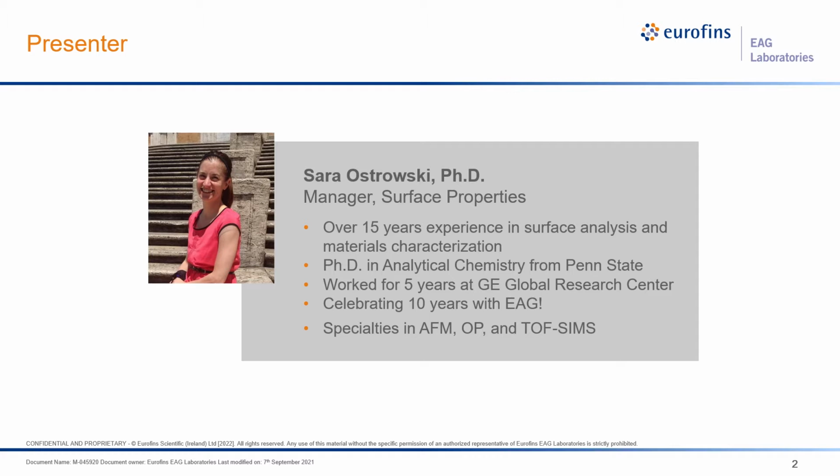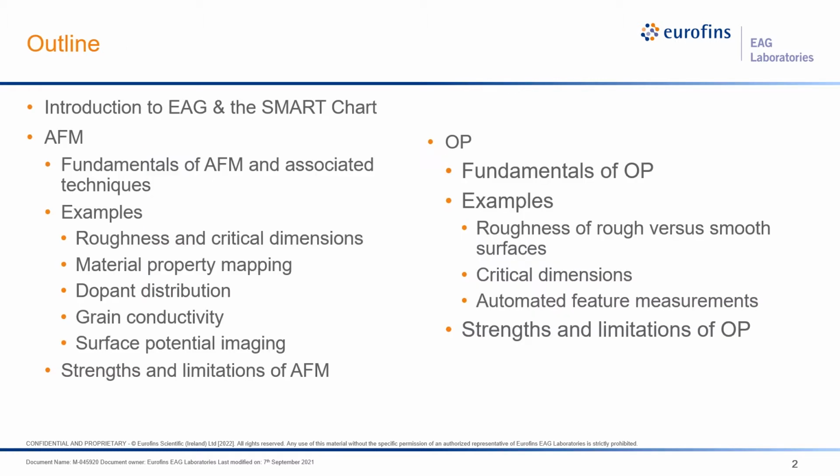This webinar will cover two techniques often used to characterize surface topography and roughness, AFM and OP. My goal is to emphasize the usefulness of these techniques by showing you data from real-world examples. The webinar will be divided into 4 general sections.